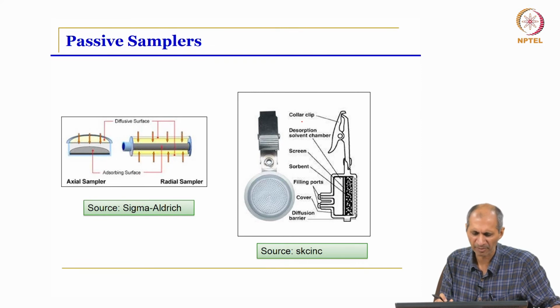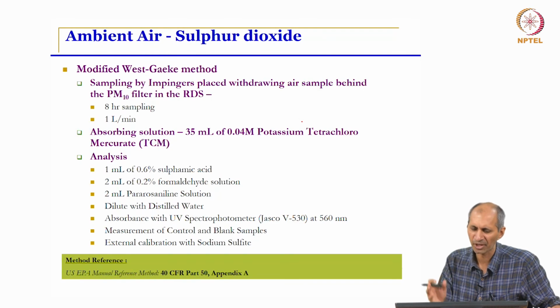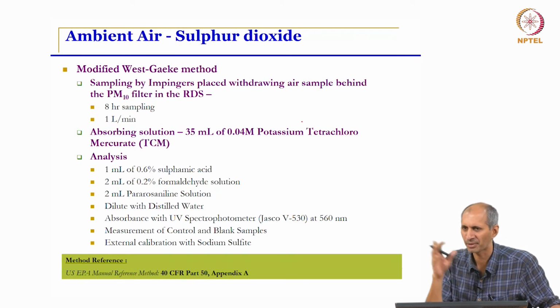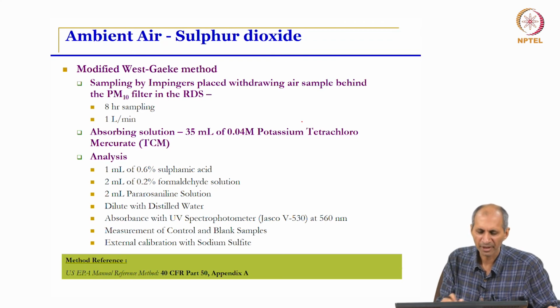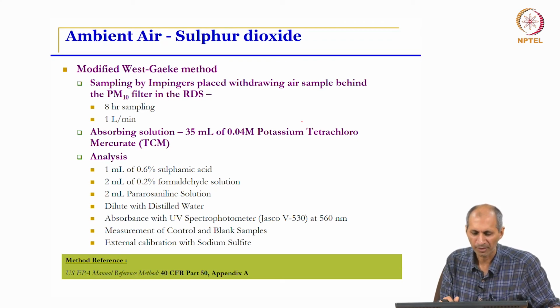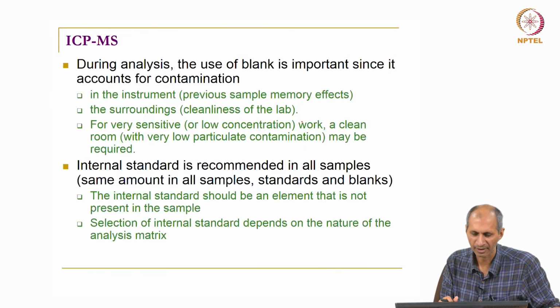There are various kinds of passive sampling devices. People have worked with a lot of things. This is used in indoor air pollution a lot. People use it to find out what passive smoking is, people in restaurants and bars and all that. So they have this thing sitting there. And there are some standard methods for measurement of pollutants like sulfur dioxide and nitrogen oxides.